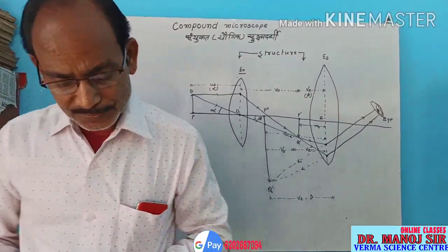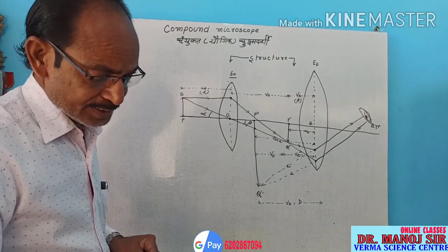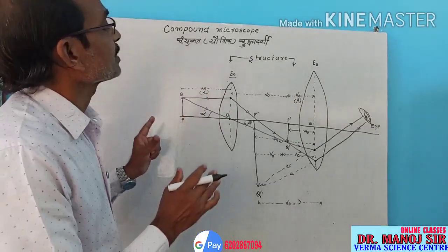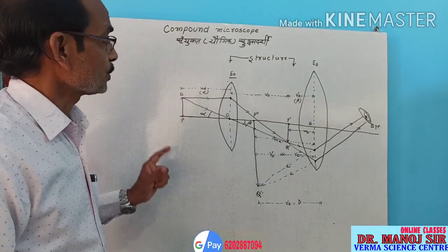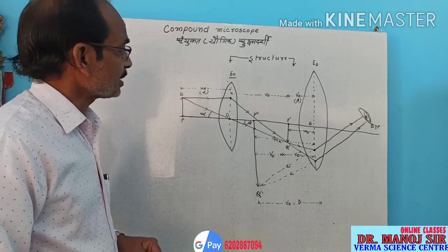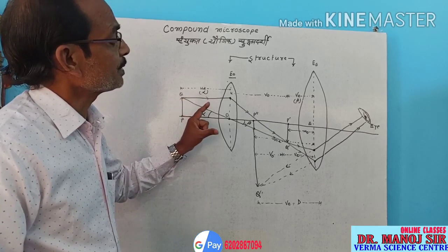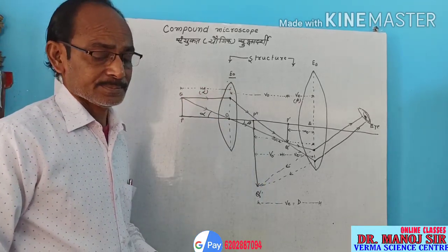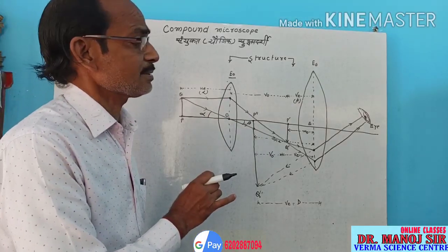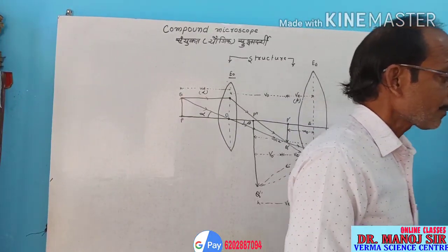The image of it we get under clear vision, so it is very magnified optical instrument, give a quality, give a visual scene of anything that is teeny, smallest and fine particles.